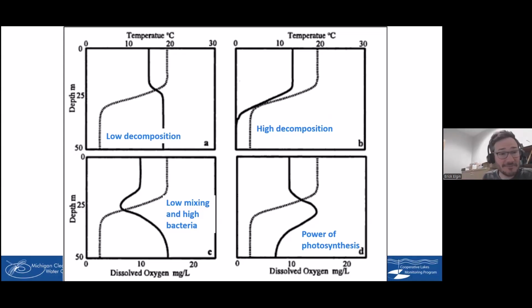It's pretty exciting when we're able to use those meters that Tamara just mentioned, the Pro 20 that we use in our program, where we are collecting temperature and dissolved oxygen as we go down and through time. So starting in May all the way through September, we get a chance to see how our lake sets up in stratification and how our dissolved oxygen changes through time.